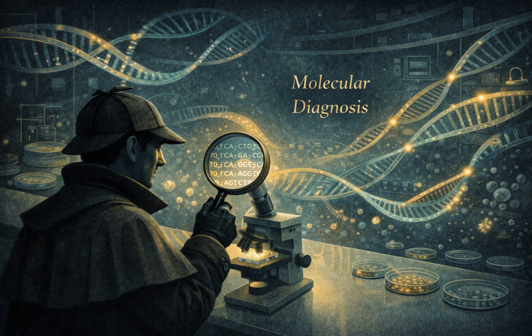And finally, there's one more isothermal method that has a very, very cool visual trick. LAMP. Ah, yes, loop-mediated isothermal amplification. LAMP is fascinating, if a bit complicated. It uses a set of 4 to 6 different primers that are designed to recognize multiple regions on the target DNA. And they do something strange to the DNA structure, right? They do. They cause the amplifying DNA to loop back on itself, creating these complex cauliflower-like DNA structures. It's an incredibly rapid and efficient amplification process.